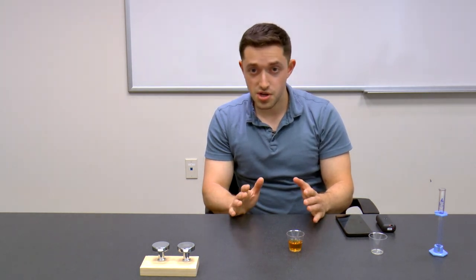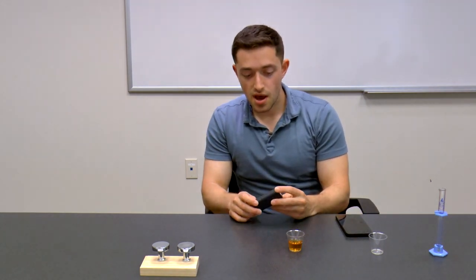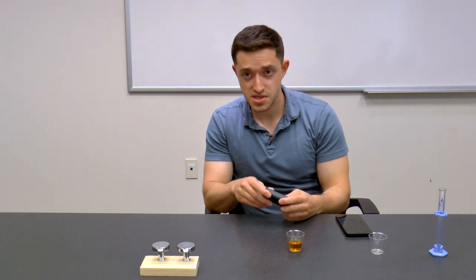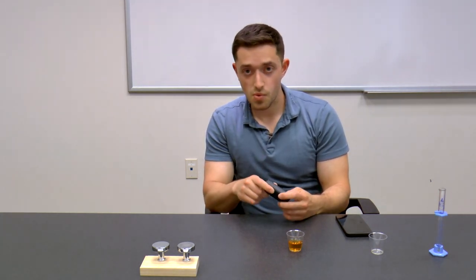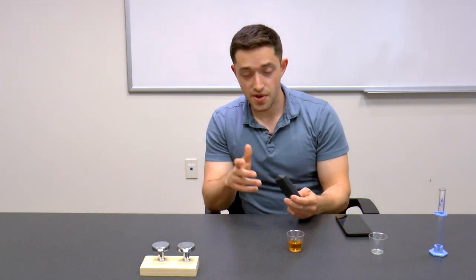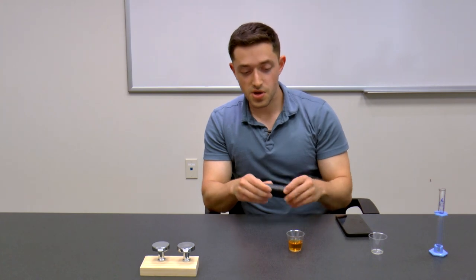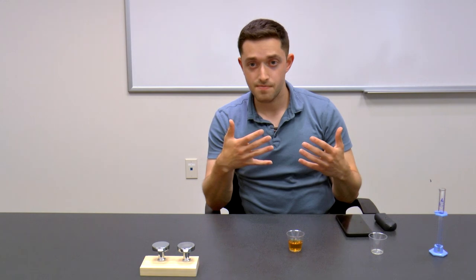It doesn't necessarily need to be this way. Another strategy is reflection mode. With me today I have a module which contains the C12666MA spectrometer, an Arduino Bluetooth board, and a white LED — developed by Antriman Doss at MIT Media Labs. This module will shine light onto the beer, and light will reflect back up into the spectrometer, giving us a reading.